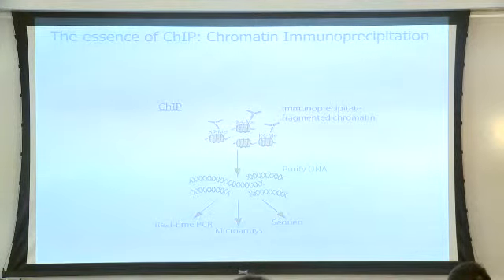Again, starting with chromatin, schematized here. It's fragmented into little pieces. We strive to fragment them to pieces the size of a couple of histone octamers. Antibodies are introduced in order to pull down the complexes of interest. The DNA is recovered, and then it's subject to some kind of analysis. And the interest today is principally in sequencing as a form of analysis.